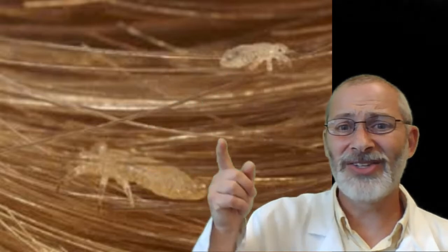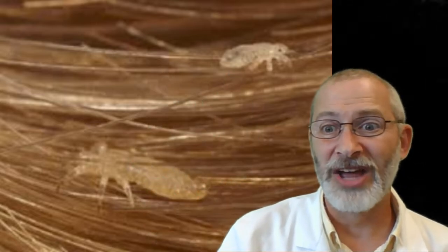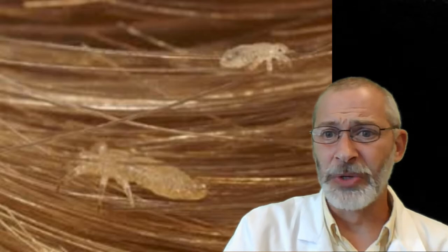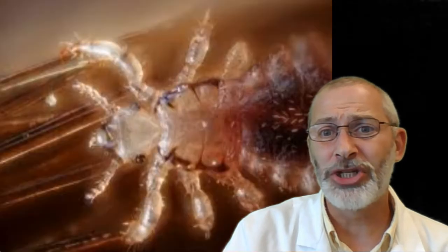These strands here are someone's hair, and these are the head lice looking for someone or somewhere. They've already found someone. They're looking for somewhere to set up shop and chow down on your blood in order to lay their eggs and carry on the next generation.